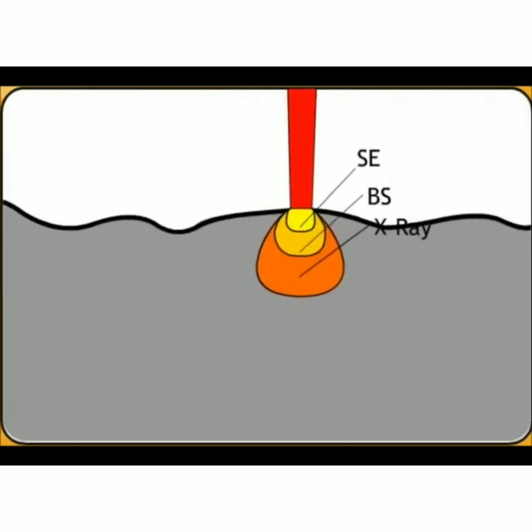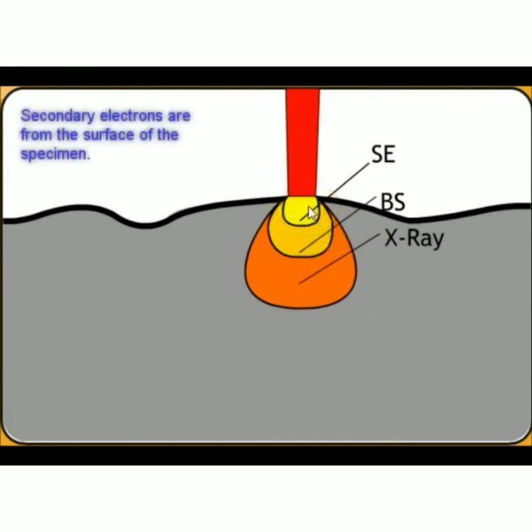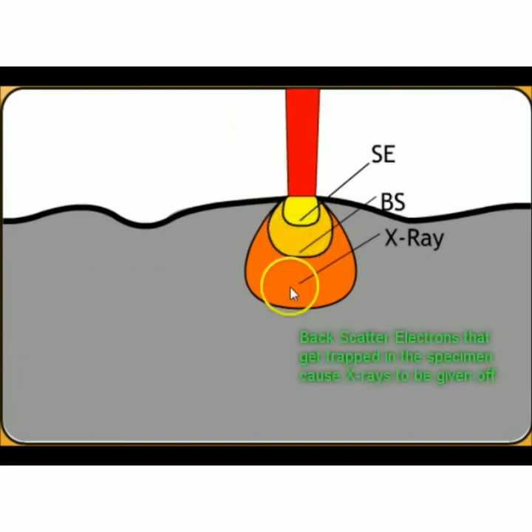This illustration will actually show you where these electrons are going to come from. So you can see here the secondary electrons are going to be surface electrons. So they're very shallow, but these are very, very good for getting surface features. And of course, that's one of the main reasons for using a scanning electron microscope. The backscatter electrons are going to come from deeper in the specimen. So some will bounce right off the surface, some will go deeper. And then the ones that are really deep actually never get back out again. So when they get absorbed, they give off x-rays. Now, we actually don't have an x-ray detector for our scope, but you can do elemental analysis by looking at x-rays. So the detectors that we have on our scope are the secondary electron detectors and the backscatter detectors.